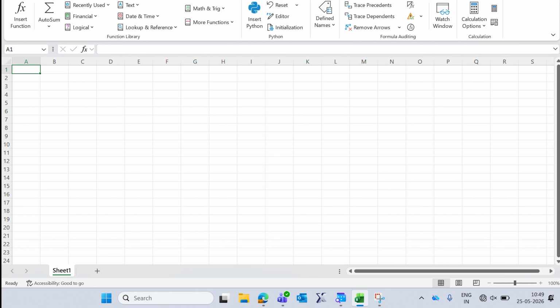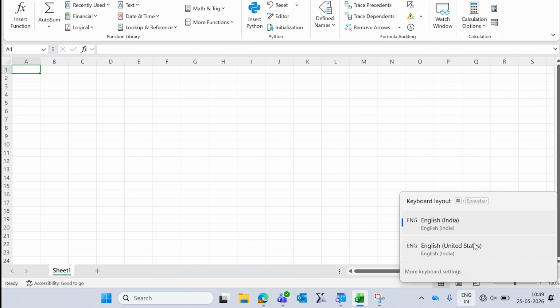On the PC, open your application of choice and put the cursor where you want the data to be inserted. In our case, we have prepared an Excel file for the data. Make sure your keyboard settings are set to English, US.